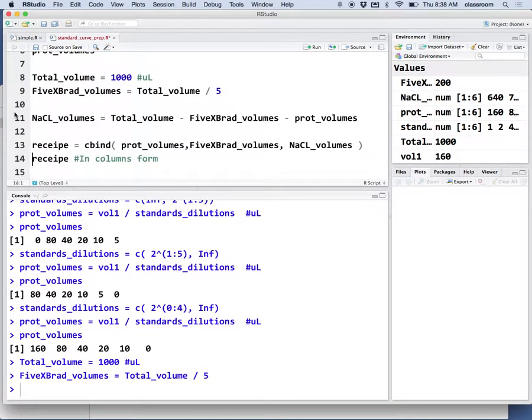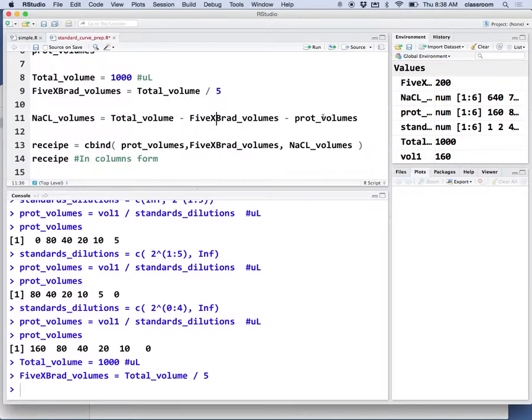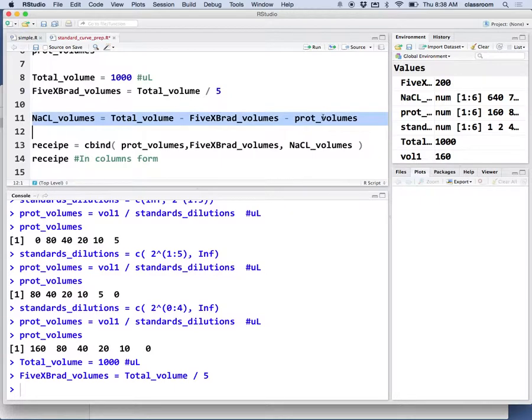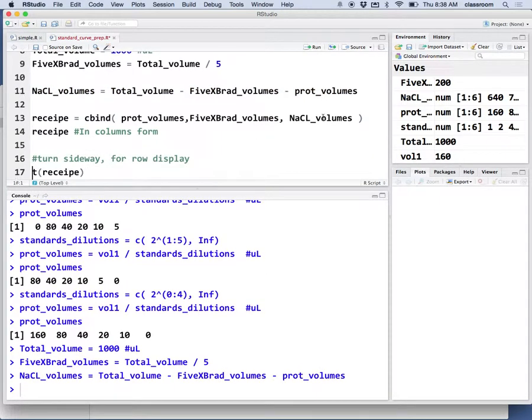Then we calculate the sodium chloride volume. The sodium chloride volume is the total volume minus Bradford minus protein volume. Now we have the recipe.